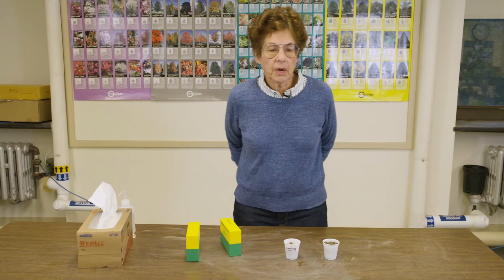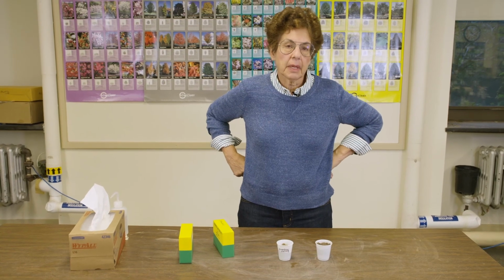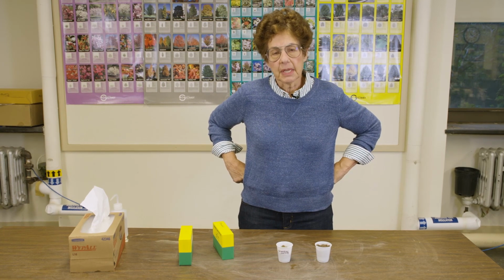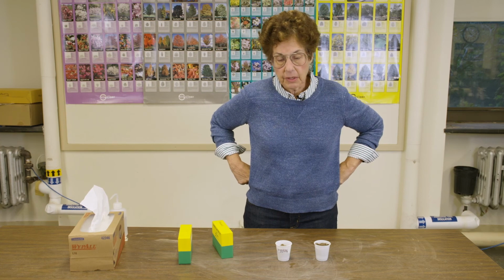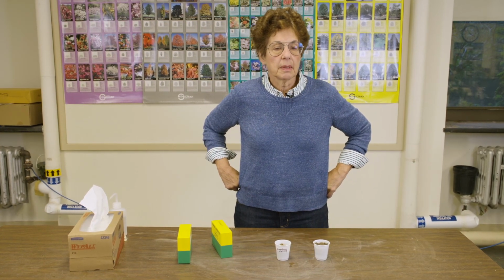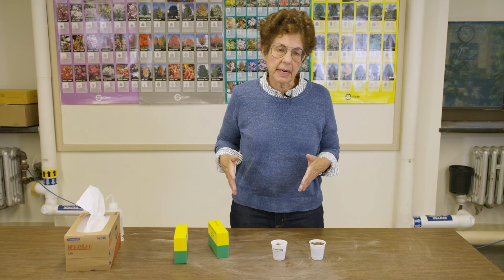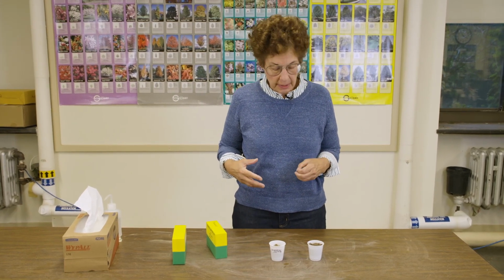Okay, so we've been talking about the physical aspects of soil, but there's a chemical aspect of soil that we can test very easily. That is pH, which measures the acidity or alkalinity of any substance. And in soils, pH determines very much what nutrients are available to plants. So some plants can tolerate a wide range of pH, and some have a very narrow range of pH where they grow well in. So we need to know this in terms of plant selection.